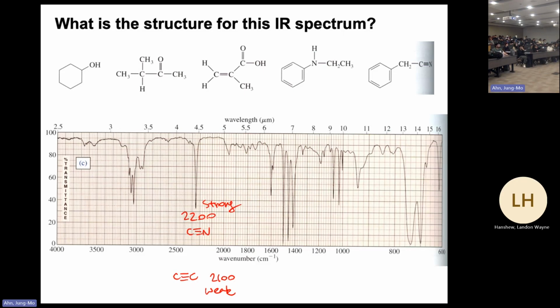So do we have a 1600 signal? And yes, we do, right? So we do have a benzene there. And because of the benzene, we get the unsaturated carbon hydrogen stretching signal, which will show up a little above the 3000 line. So you can see that band is higher than 3000. That's the one coming from the hydrogen of the double bonds. And that molecule has no carbonyl, so we see an absence of that signal right there. Otherwise, it would be pretty strong if this molecule had a carbonyl. So all these things check out. So I think this spectrum is for that one.